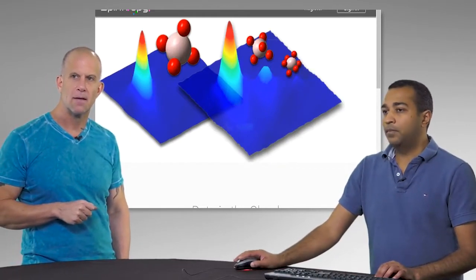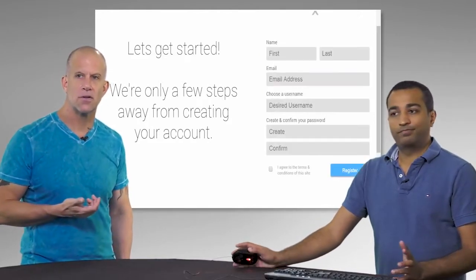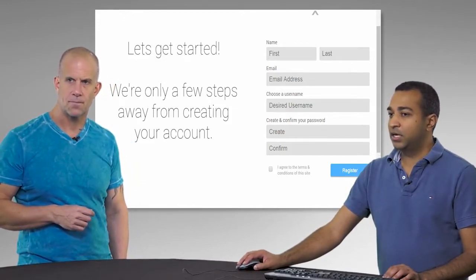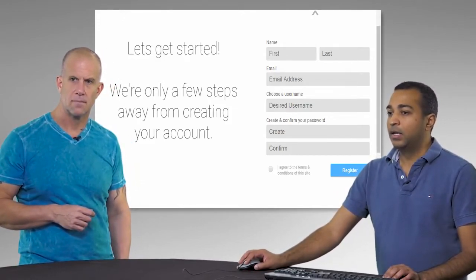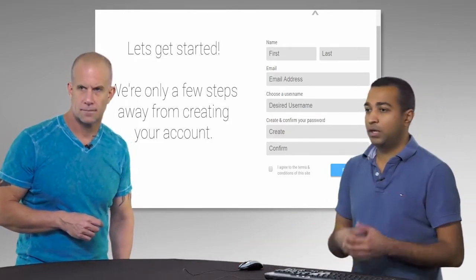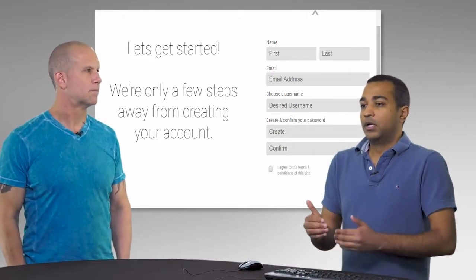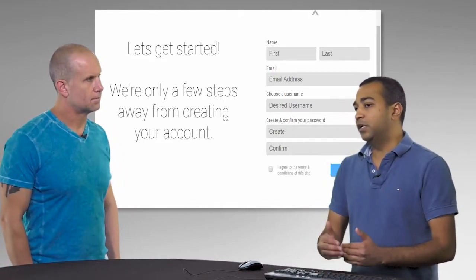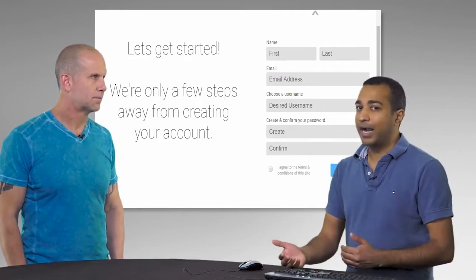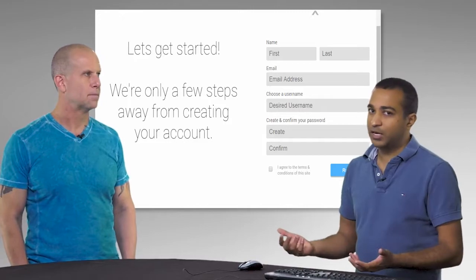Yeah, so if you're at the Magnetic Resonance Center and you're a user, you'd come in here, hit the register button, and create a user account. Put in your name, email address, choose a username, and the website will send you a verification link. You click that, and then there are a couple of other extra items you need to do in your account to get set up with the Magnetic Resonance Center, but we have a guide that you can follow. It's a one-time setup thing.